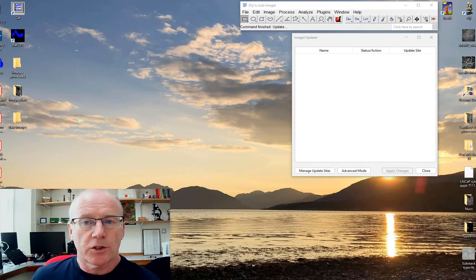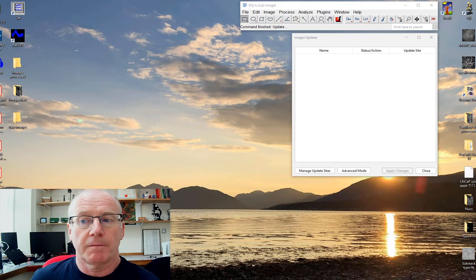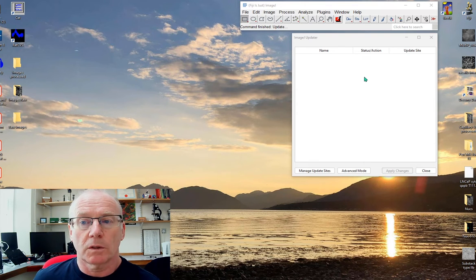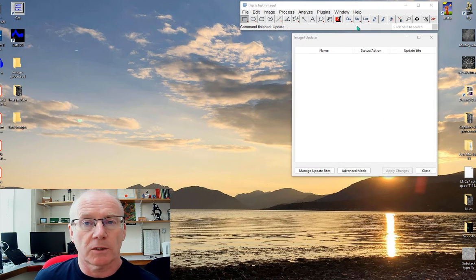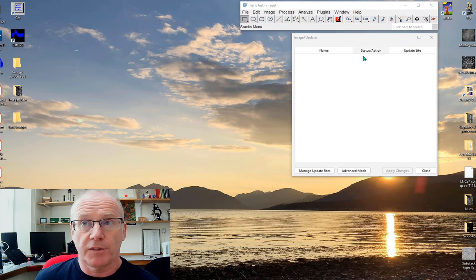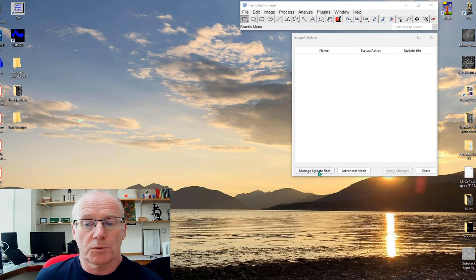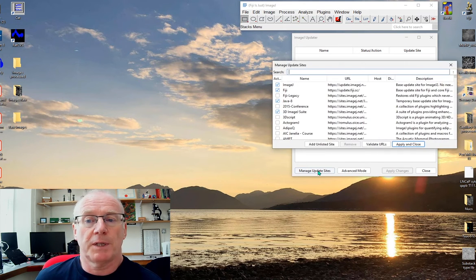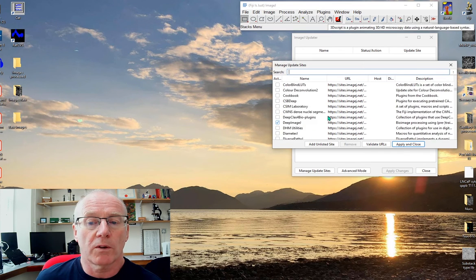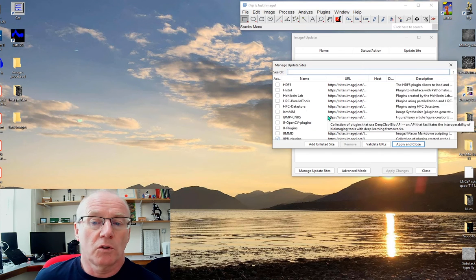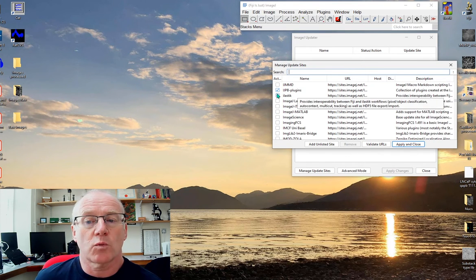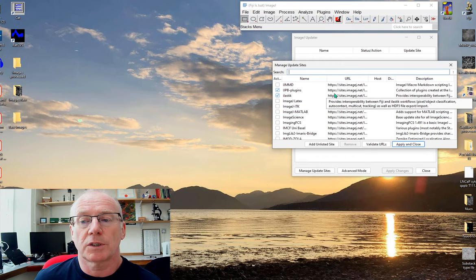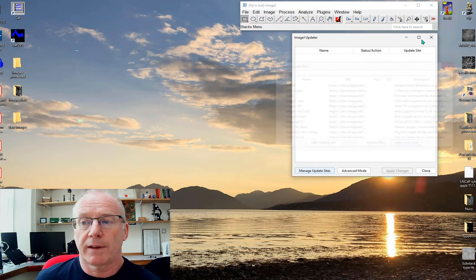The first thing is you need to have the Ilastik plugin installed. When you do updates on Fiji, once it's completed you will have the option to manage your update sites. If you scroll down you should find Ilastik as one of the options here and you can add that.